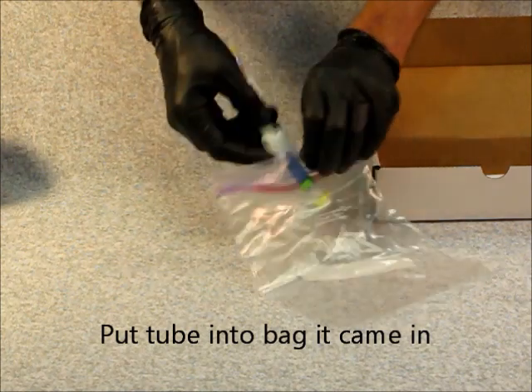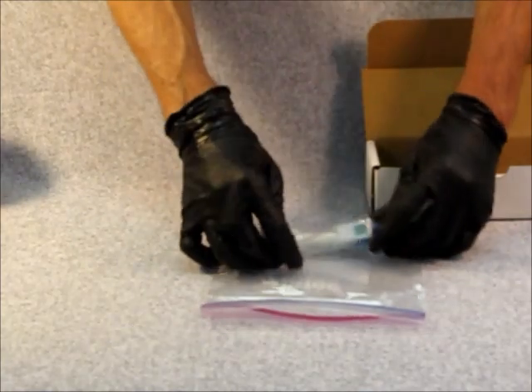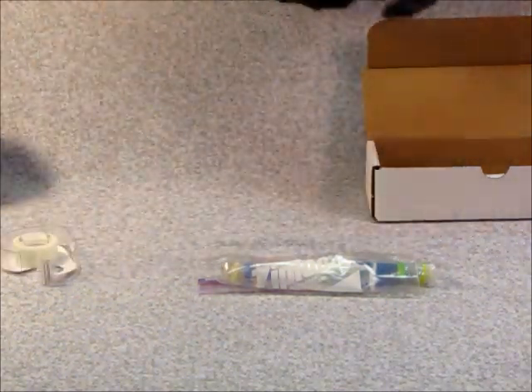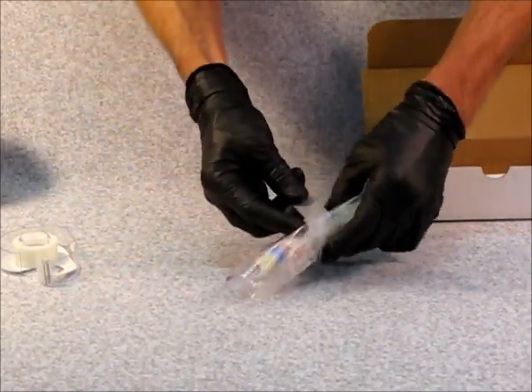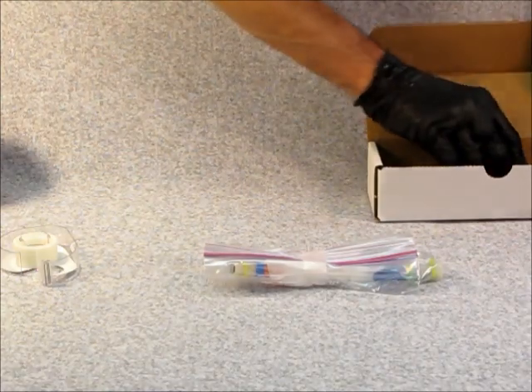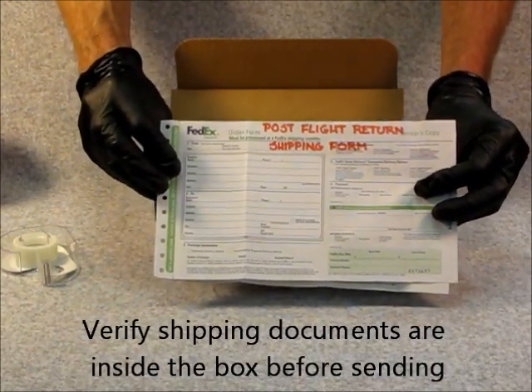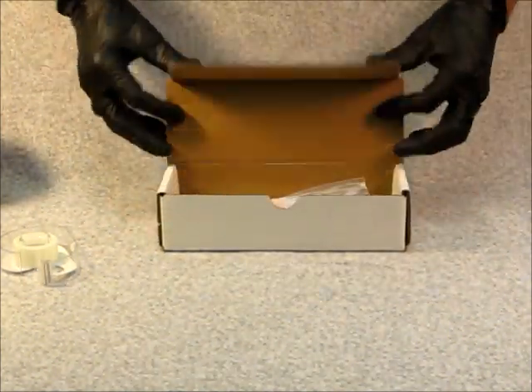To prepare your mixture tube for shipment, place it in the plastic bag that it came in. Roll the plastic bag up as shown. It is preferable to tape the bag shut. Before shipping, please verify that the post-flight return shipping form is in the box with the mixture tube.